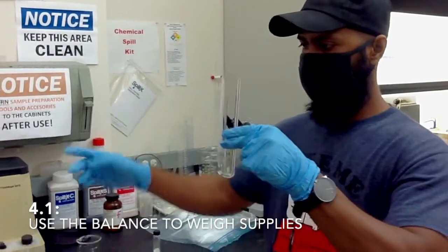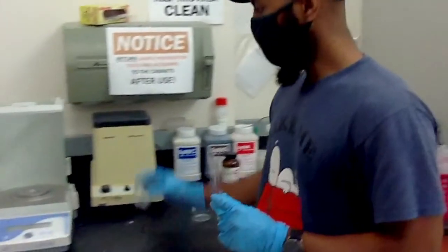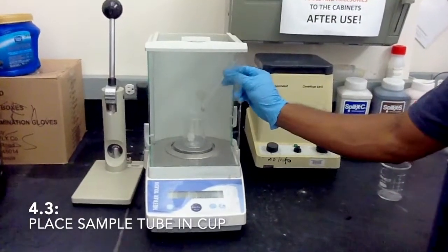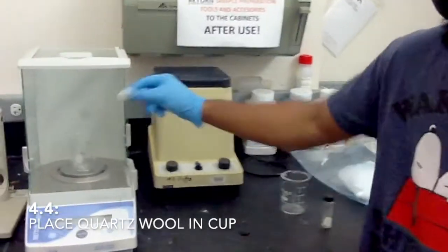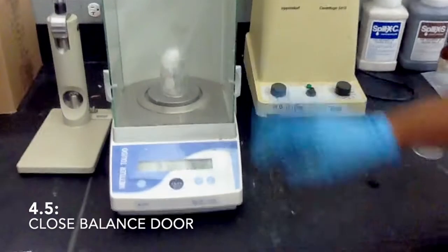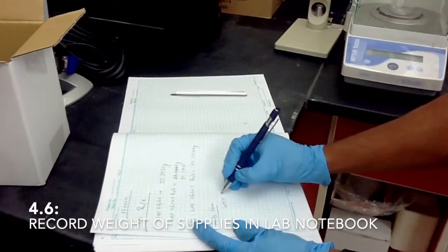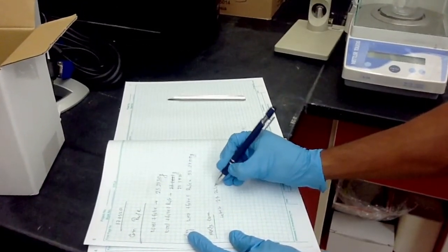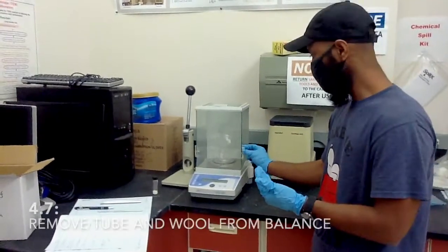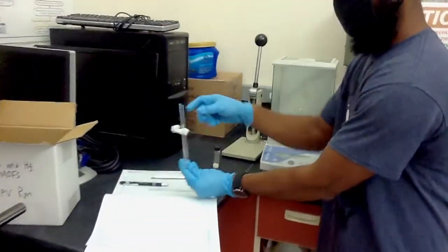And we'll prepare our sample using the balance. We need to know the exact weight of the material we're using here. So we will use one of the cups. You put this tube in here. This is the quartz wool I will use, so I put this on here. Close the door. This is the weight of the tube plus quartz wool. Once we record the weight, take out the tube and also the quartz wool. Here is the tube and quartz wool.